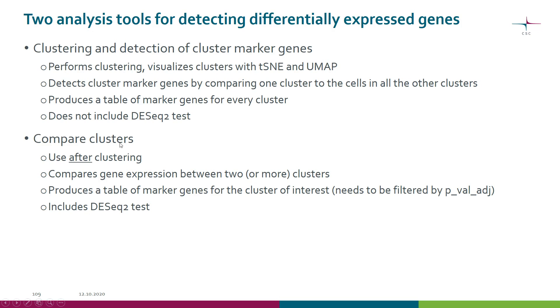There is another tool called 'compare clusters,' which does only the differential expression analysis. You should run the clustering tool first and then provide that R object as input here. Here you can specify what kind of comparison you want to make — for example, compare gene expression between just two clusters by defining the clusters, or do one cluster versus all the other cells. The result table contains all genes, so you still need to filter by the adjusted p-value. This tool does include the DESeq2 test because you typically run it on a smaller number of cells — just a couple of clusters.